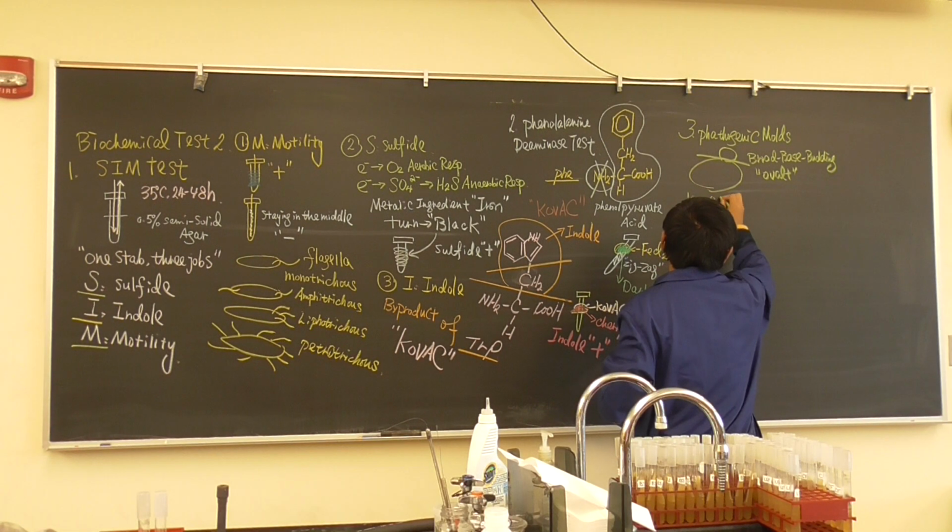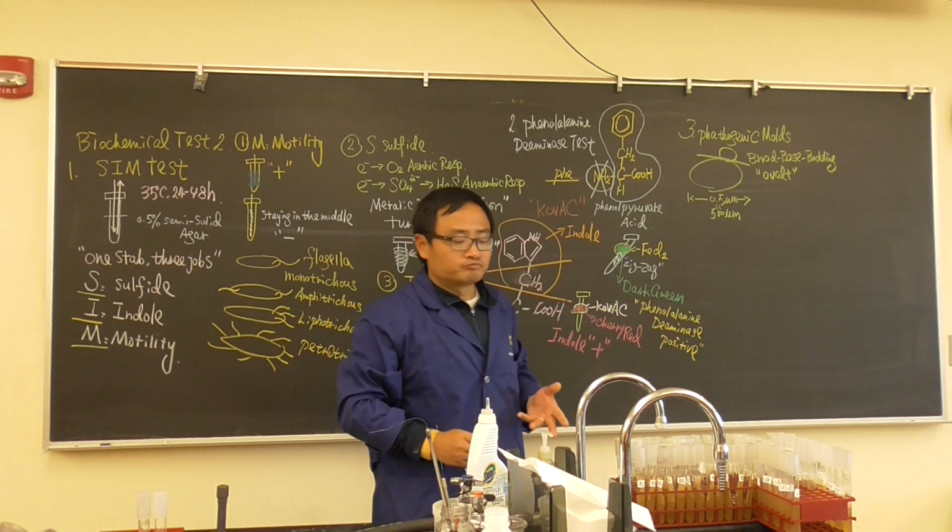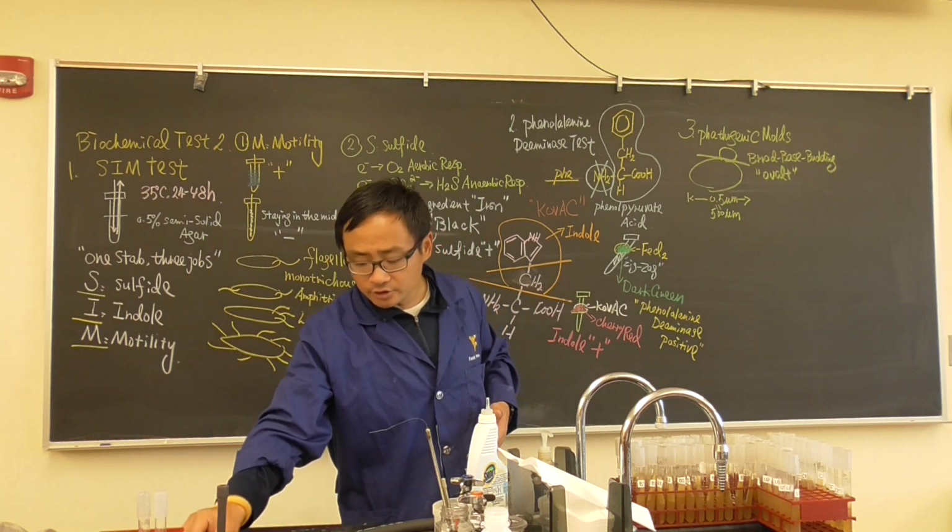This is about 0.5 micrometer, sometimes even more than that. Sometimes we have 500 micrometer. So it's larger than the bacteria.